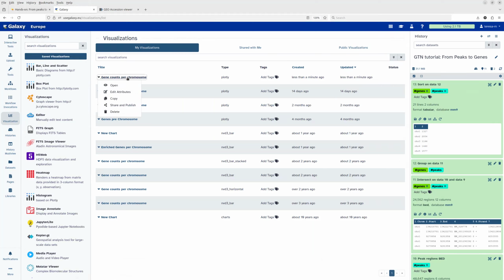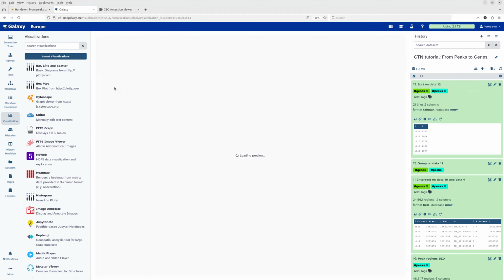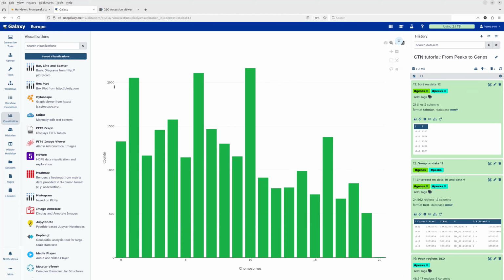And if you open up this one, you can see the plot again once it comes. Yeah, here you will have your plot again. Yeah, so this visualization is a nice option because most of the time, if you do any kind of analysis, you want to visualize the data you analyzed at the end. And I would encourage you to just see what options there are and just play around with them and see whatever fits for your data and makes sense.